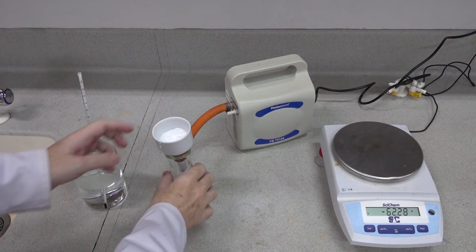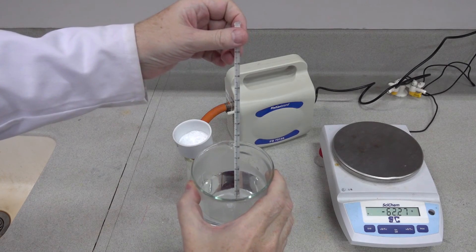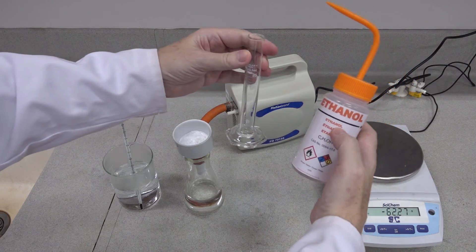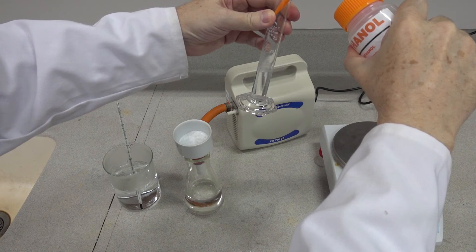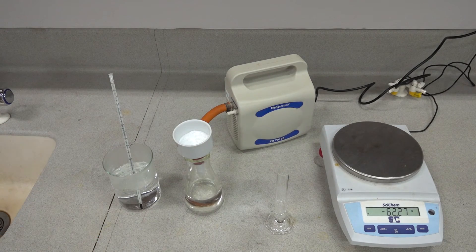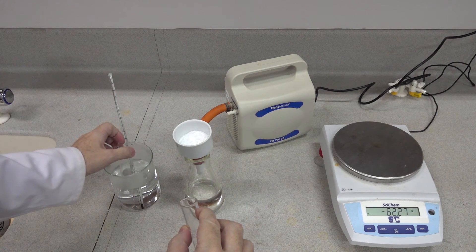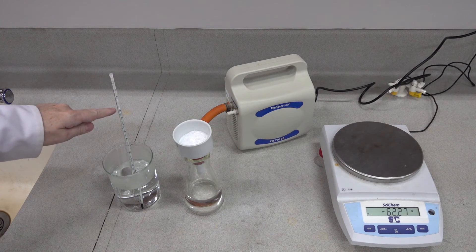In the next part of the experiment we're going to recrystallise our crude product — our crude aspirin. We're told to prepare a water bath at about 75 degrees centigrade, which this one is. Into that we're going to introduce 15 cubic centimetres of ethanol in a boiling tube. This is the recrystallising solvent — it will dissolve the aspirin. That goes into the boiling tube and then into the hot water bath. Ethanol boils at 78 degrees centigrade, so at a temperature of 74 we shouldn't see any boiling; we're trying to avoid boiling the solvent.